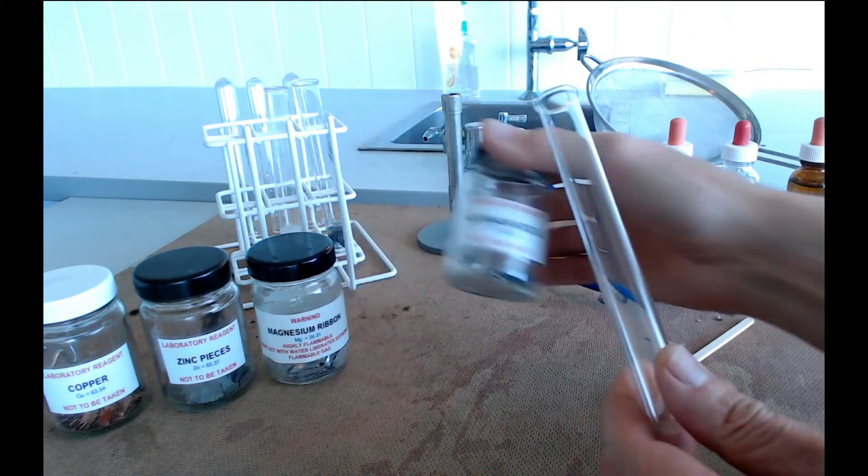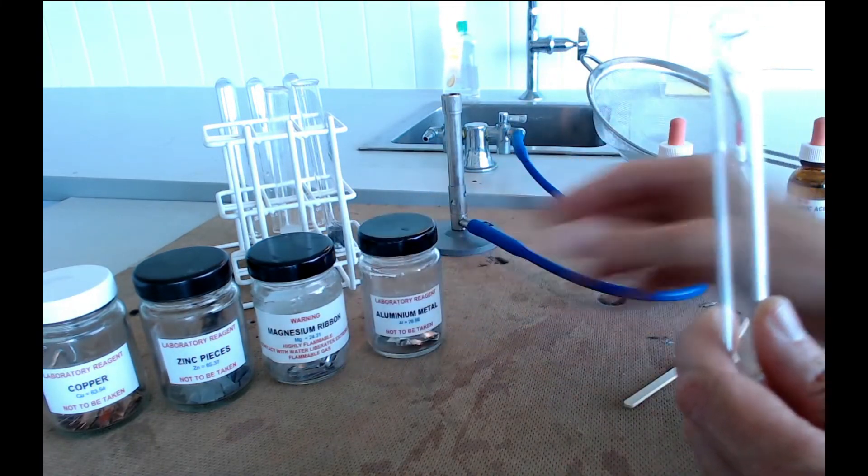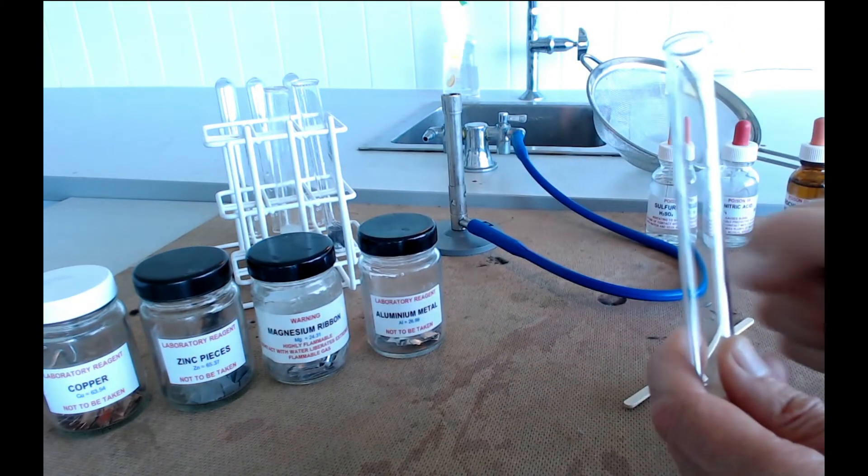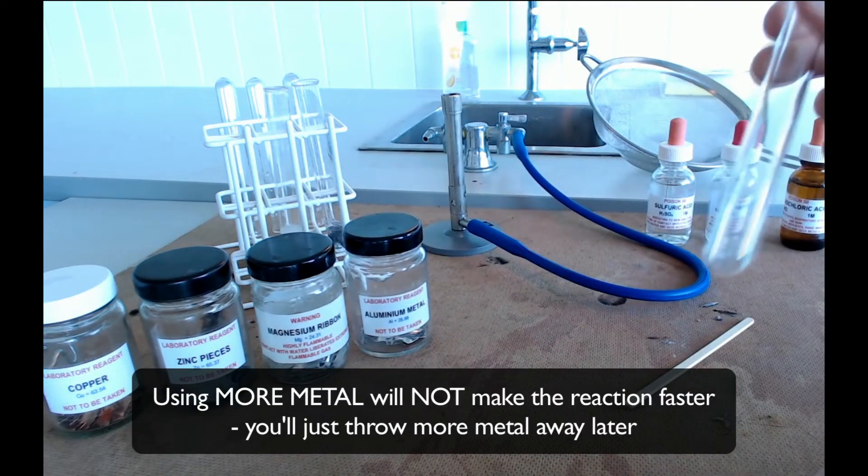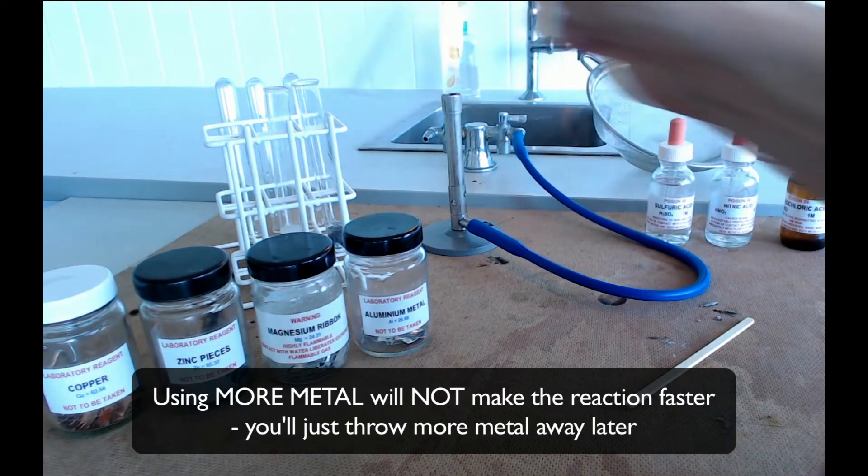So let's say you wanted to do aluminium next. We take some acid, put it in the test tube, put the aluminium in there with it. Give it a bit of a swirl and see if it starts reacting or not.